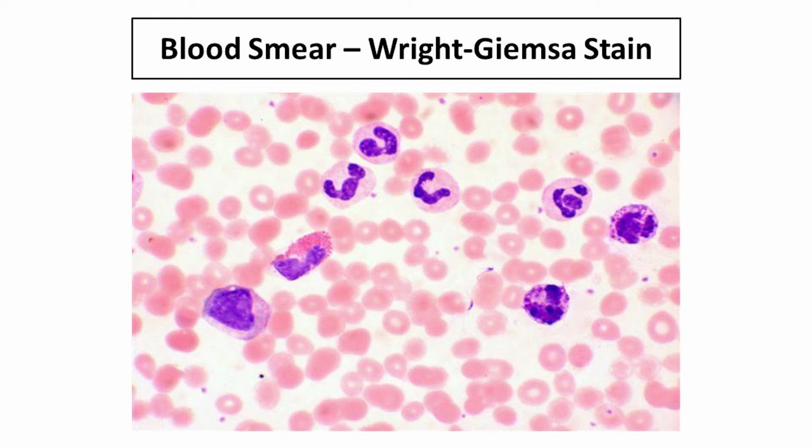And you can see these cells are pretty neat. They are mostly erythrocytes. Those are the little donut hole things. They are red blood cells. They are one of the only cell types that do not have any DNA in them, so that's why you can see through them.